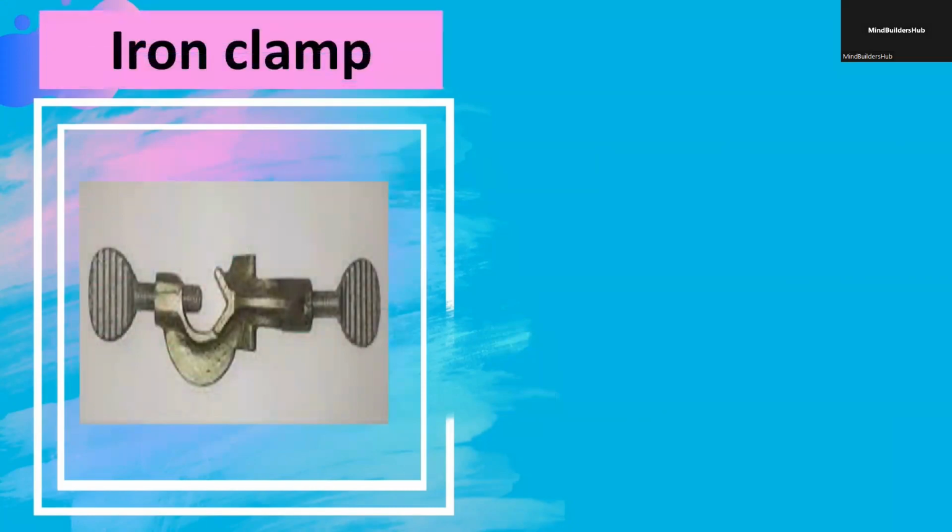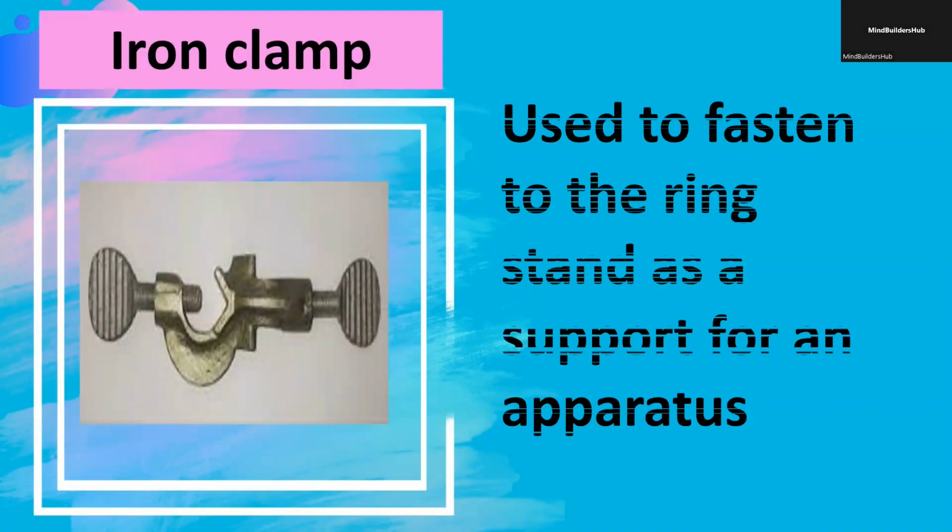And another is the adjustable iron clamp, used to fasten to the ring stand as a support for an apparatus.